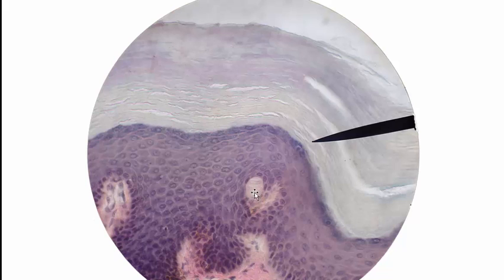And what's actually happening here is one of these dermal papillae is coming up a bit sideways, and we're just seeing the tip of the dermal papillae with the Meissner's corpuscle or tactile corpuscle inside of it. The rest of the dermal papillae behind this purple area would be coming down and connecting to the dermis. So this is actually a part of the dermis coming up in here with this receptor inside of it. And again, this receptor is a tactile corpuscle or Meissner's corpuscle.